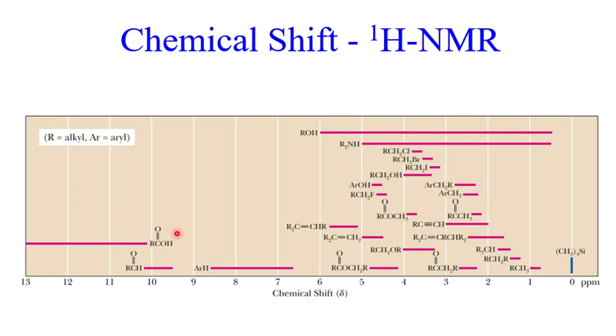So now if you change that with a different functional group, based on that you can get an idea whether the delta value after modifying your sample will come upfield or downfield, right hand or left hand direction. So you just look into how the electronic environment is changing. If electron density is increasing, it is shielding the external magnetic field, so the delta value will be lower. If electron density is somehow reducing, it is experiencing more magnetic field, so it will come at a higher delta value.